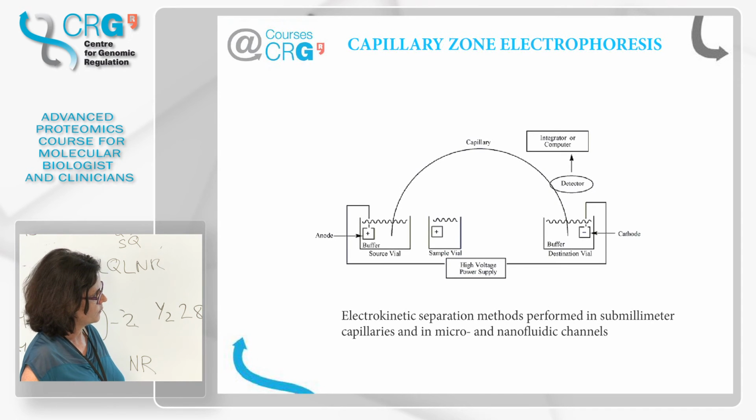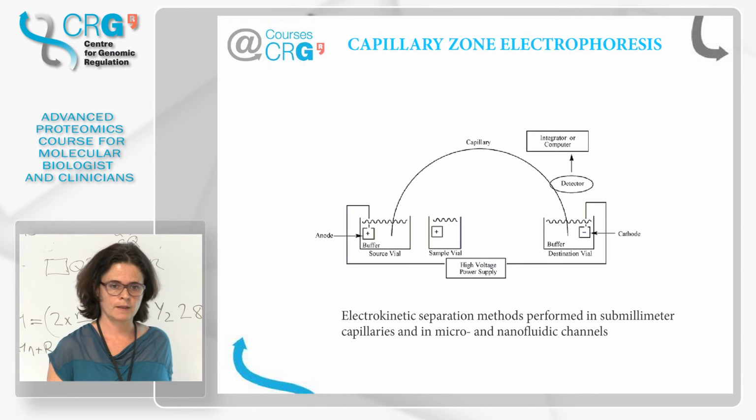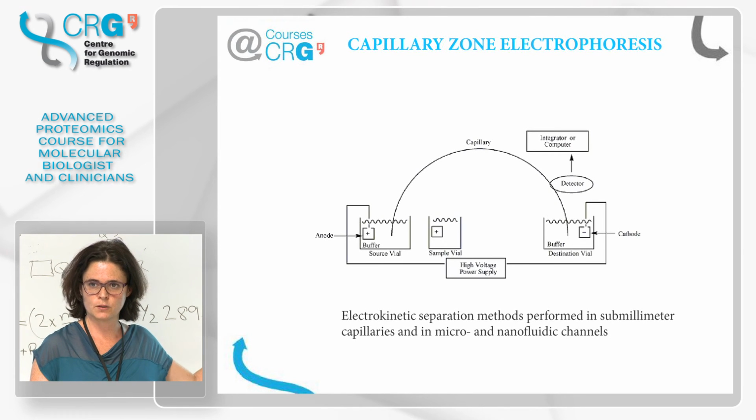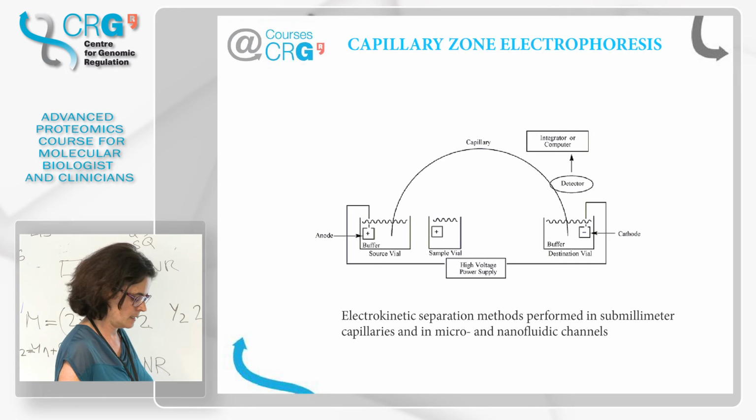Another type of electrophoresis that is used is capillary zone electrophoresis, which is also done at nanoscale, like the chromatography that we do before the MS. In fact, some instruments now come with this capillary zone electrophoresis in front of the instrument instead of the chromatography. So this is also a new tendency.